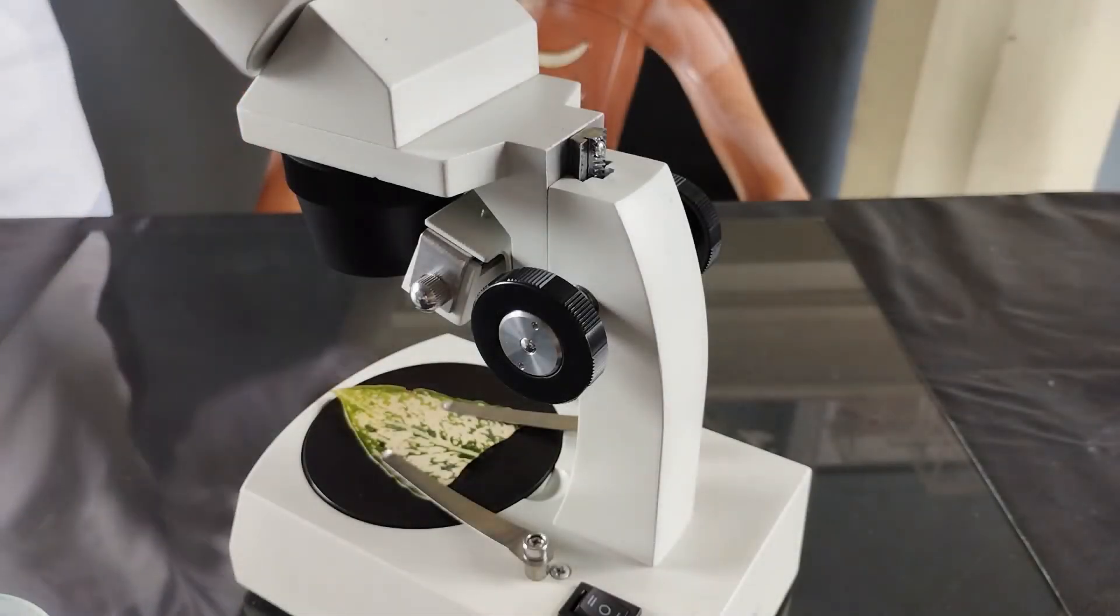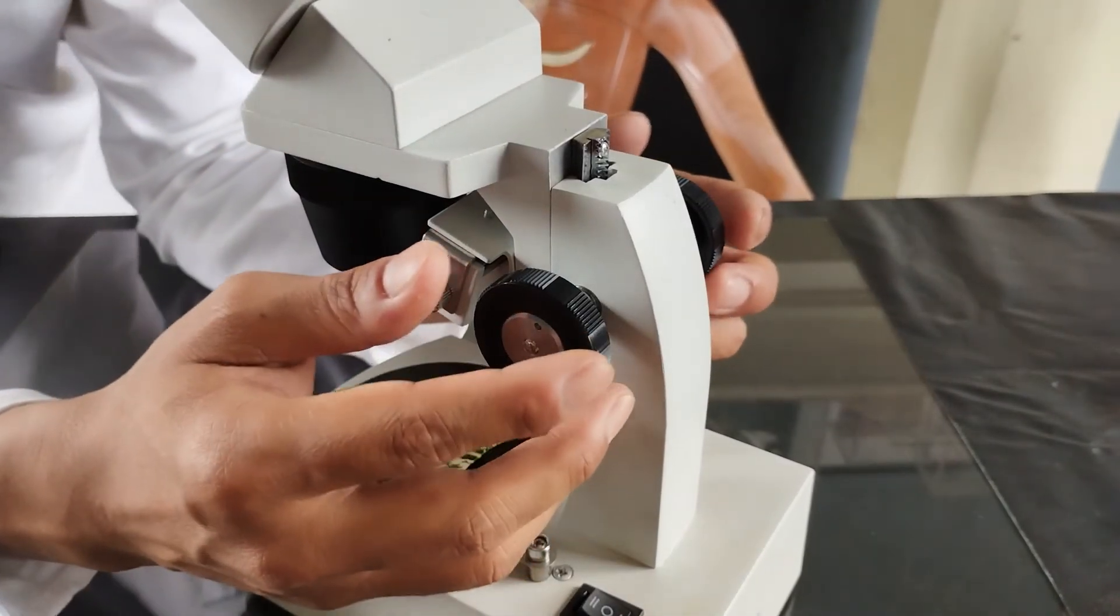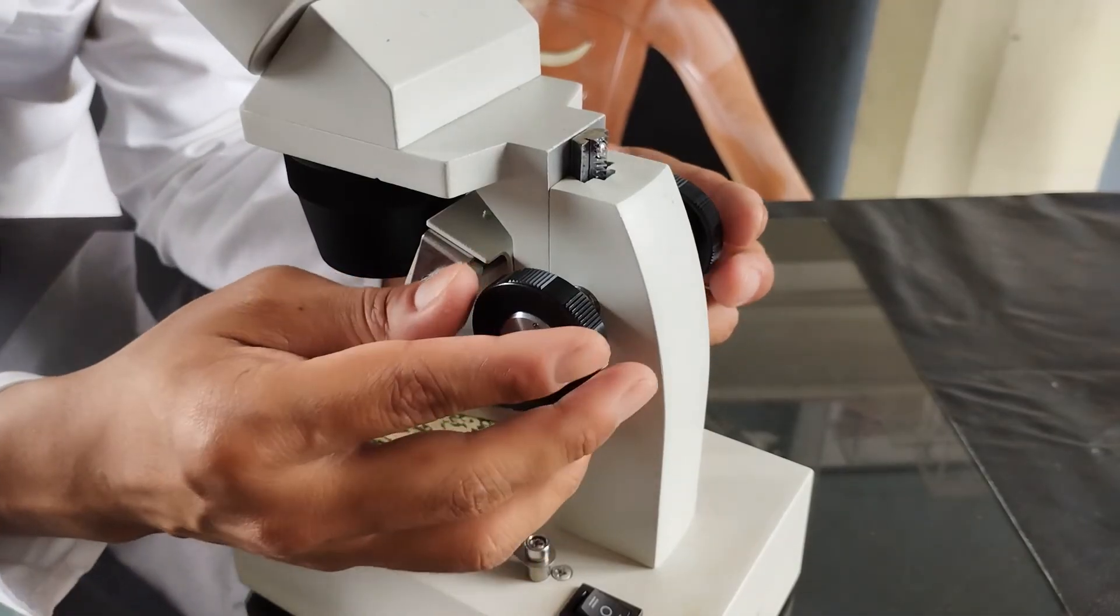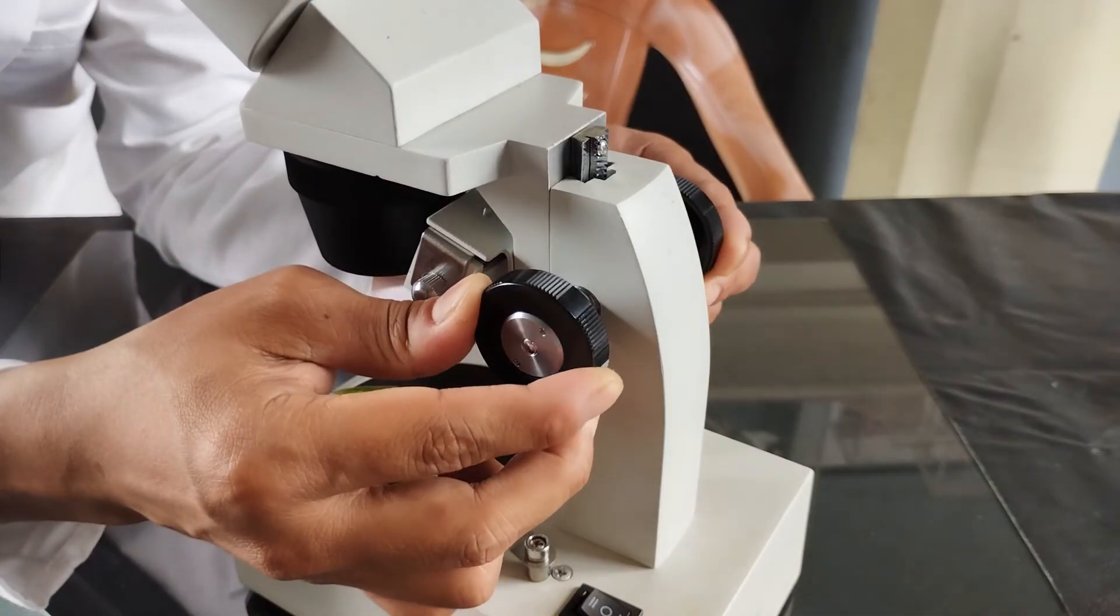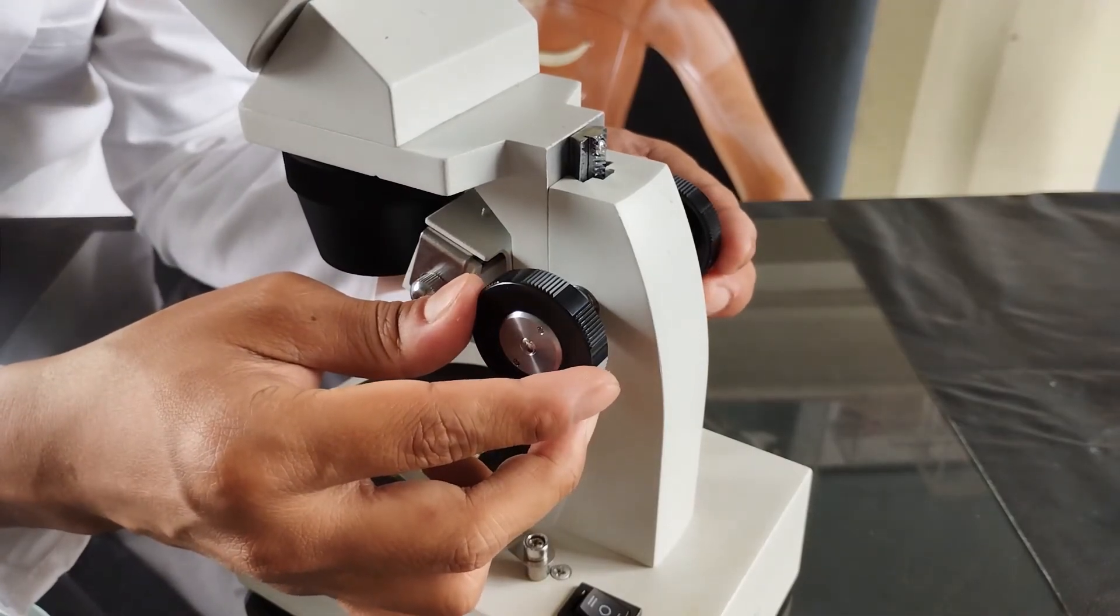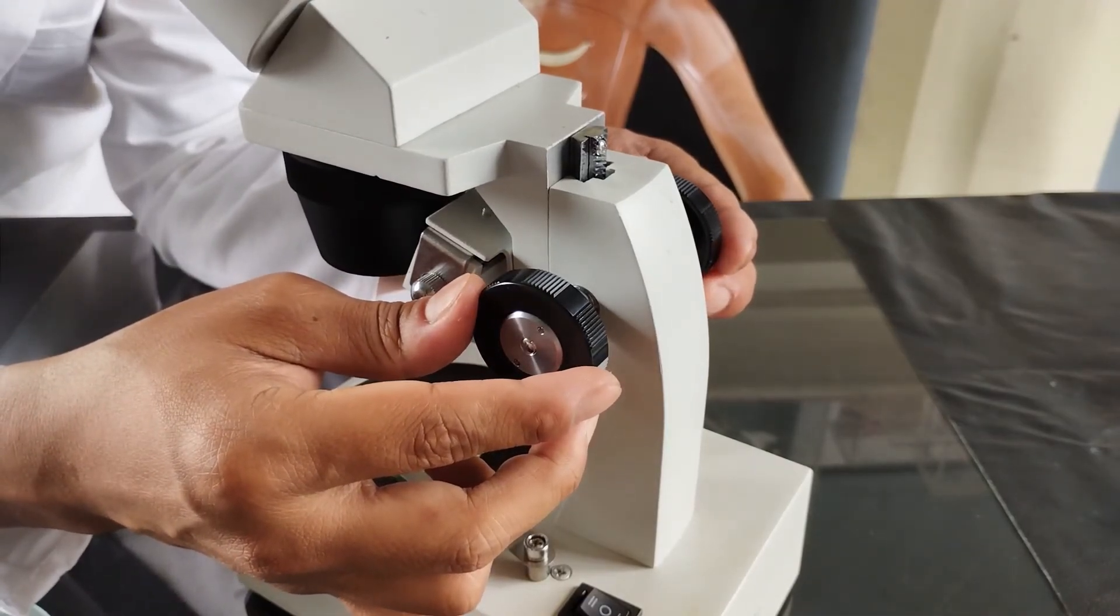Now once the eyepiece distance has been fixed and focus aligned, the objective magnification selected and the specimen placed on the stage, turn the focus adjustment knob clockwise and counterclockwise until the specimen comes into clear focus. Observe and study the specimen.